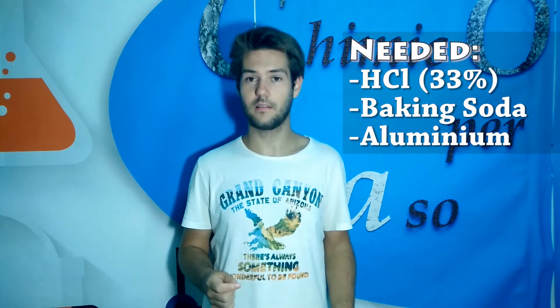Hello everyone and welcome back to Cames by Destiny. In today's video we are going to show you how you can produce some Aluminium Oxide. In order to do that you are going to require some concentrated hydrochloric acid precisely at 33%, then some sodium bicarbonate, and also some tinfoil which is Aluminium, in order to start the reaction.